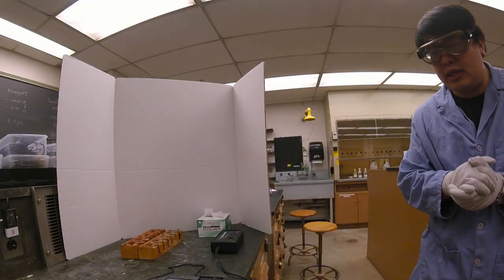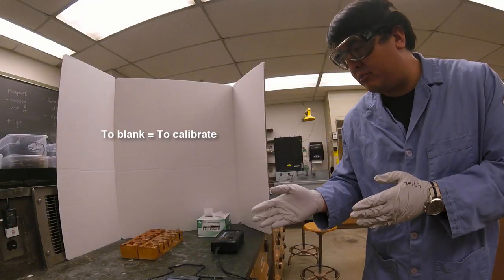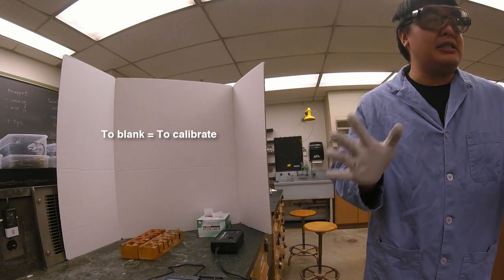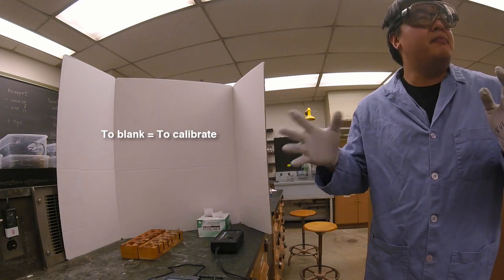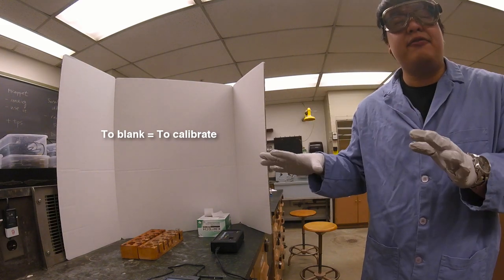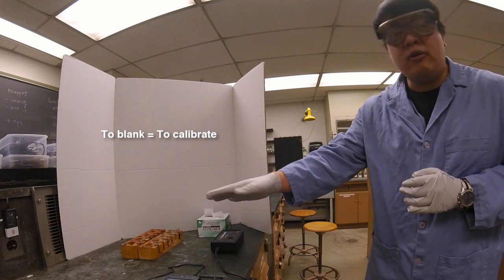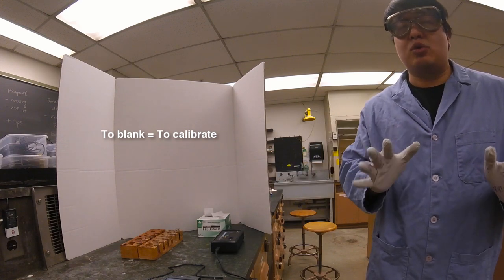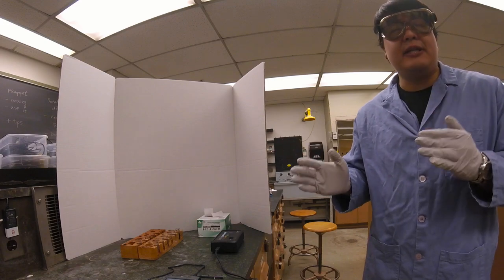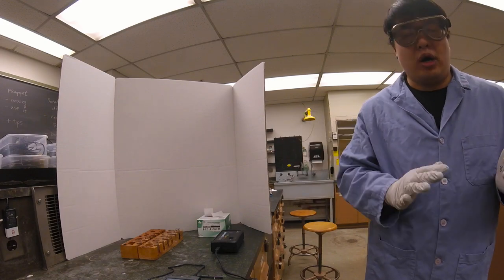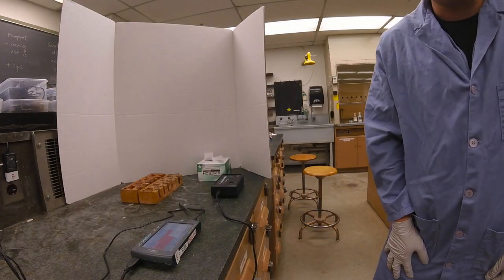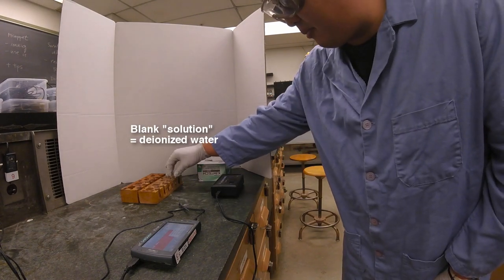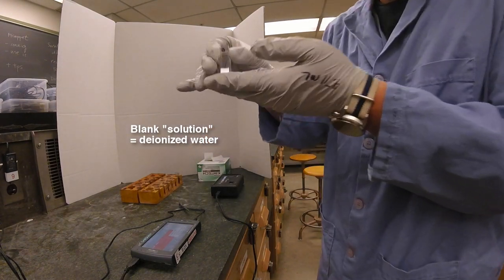The first thing we want to do is blank our machine. What that means is there's a lot of background noise we want to ignore. All our solutions are dissolved in water, but we don't want the absorbance of water, so we're going to specifically blank using water. I'm going to grab the blank from the wooden test tube holder.